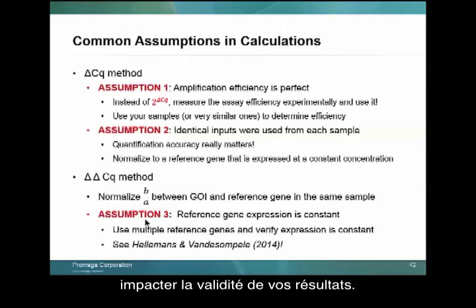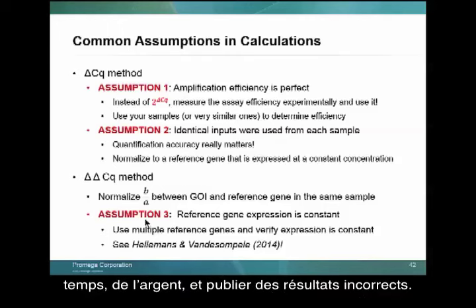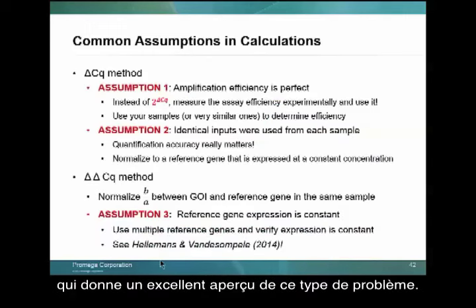validity of your results. You might as well spend the money to actually look at validating your assay rather than waste all that time and all that money and publish incorrect results. And I would refer you then to Hellemans and Vandesompele for an excellent overview of this kind of problem.